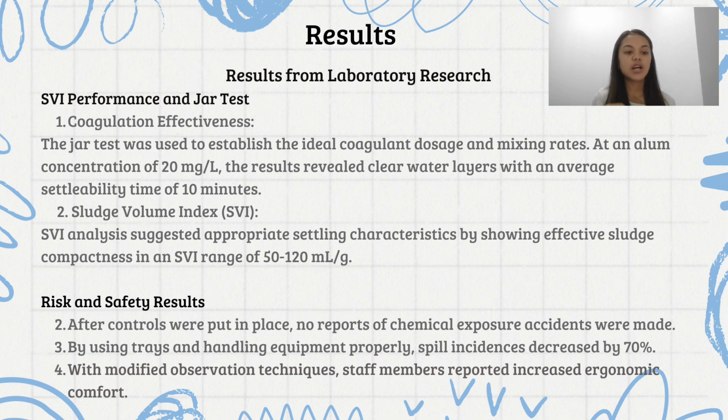So the HIRADC framework guaranteed continuous research quality while successfully reducing laboratory risk. Safe laboratory operations were immediately impacted by proactive danger detection and control strategies.